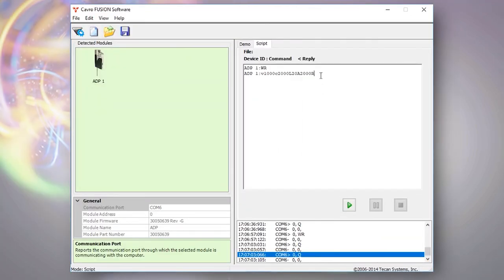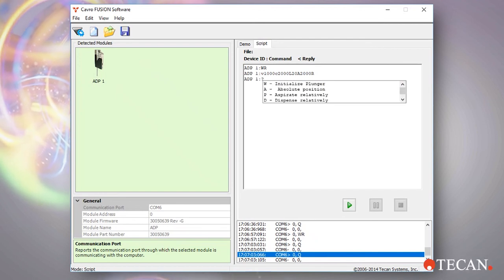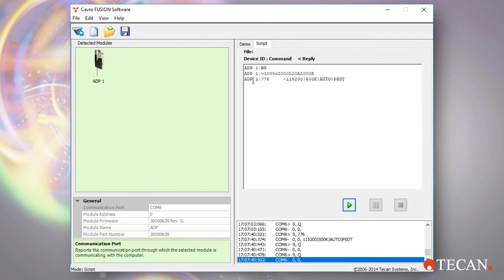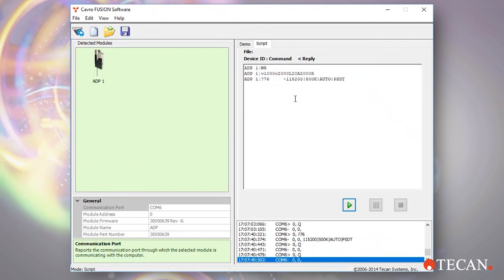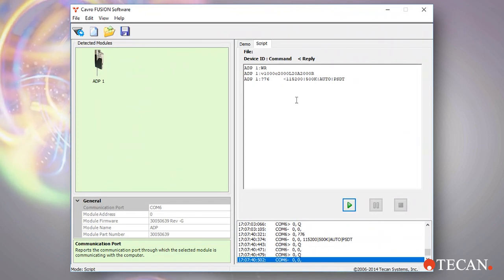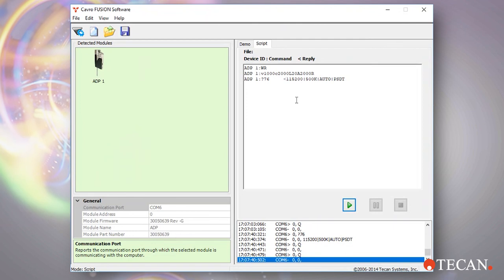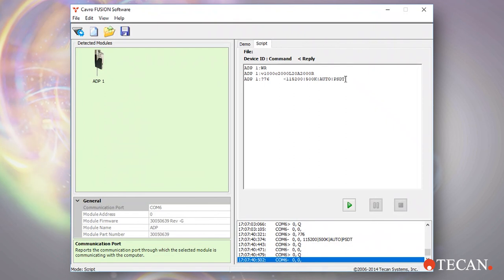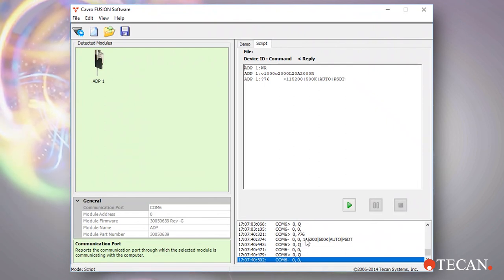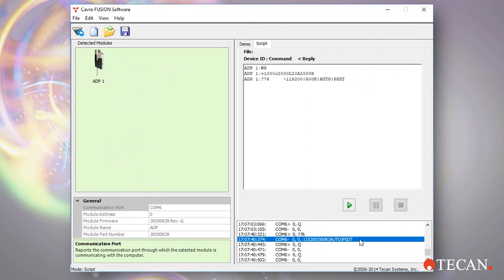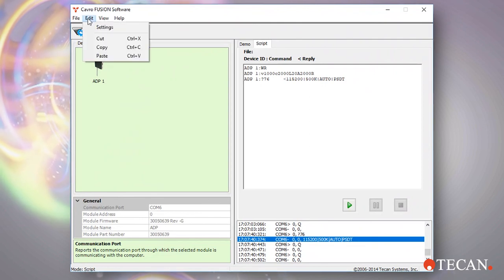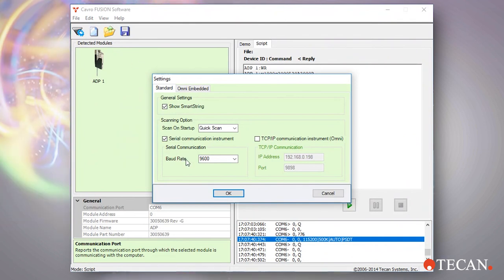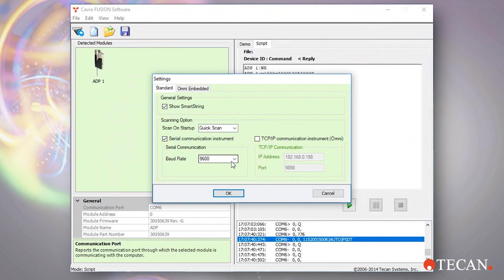Now let's try a report command. Send the question mark 76 command to query the pump configuration. Notice that the capital R or execute command may auto-append to the end of the command. Execute commands are not necessary when sending query or reporting commands and may be omitted. The pump response is displayed on the command line and also in the log. Notice that even though the device is configured for serial communication at a 115k baud rate, we have overridden that setting and are communicating with the ADP at a 9600 baud rate according to the position of DIP switch 8.